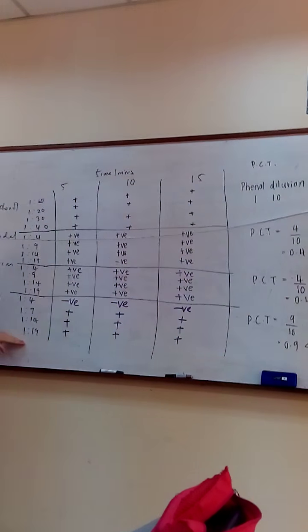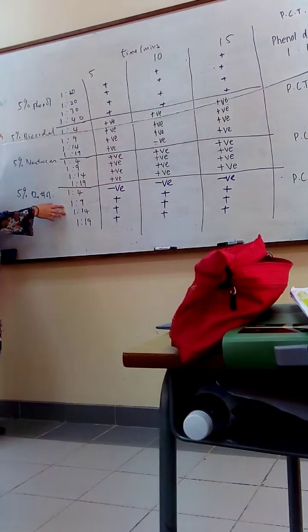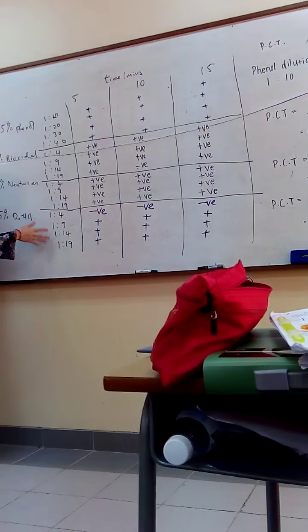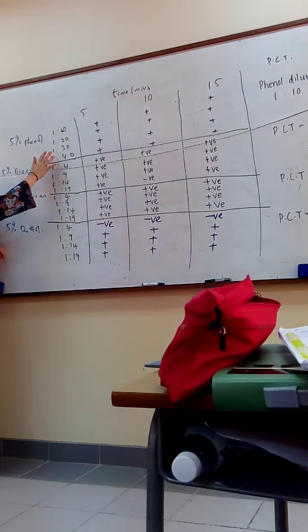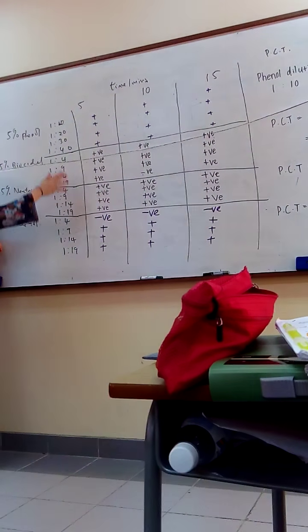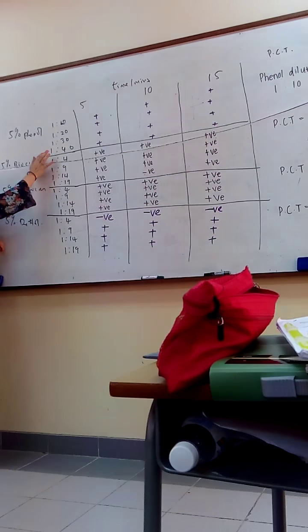Our ratio goes up to 19, this ratio goes up to 40. So if your tested disinfectant can be tested at less than 40, we can look from here. Negative will be negative. So it has to be different. This standard is 1:10, 20, 30, 40.